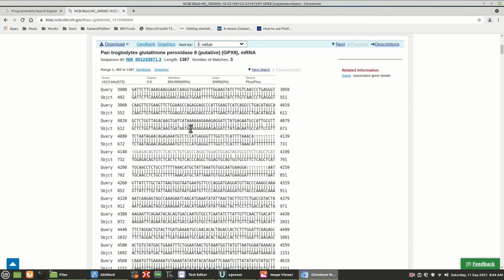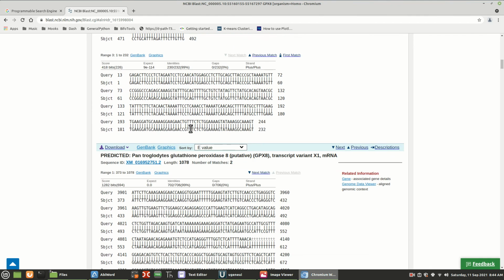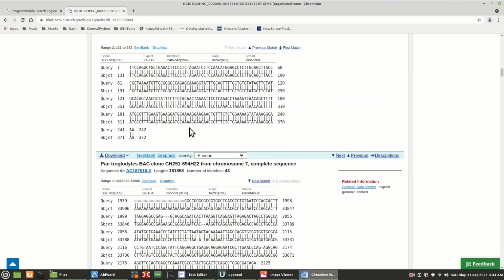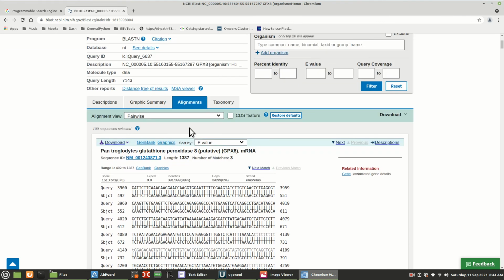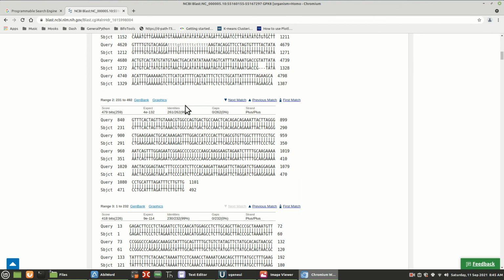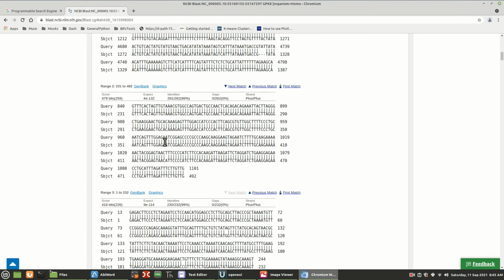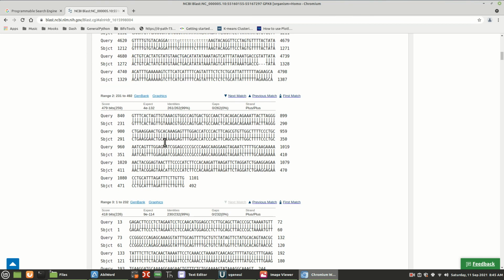the first exon would be this one, and then here's another smaller one and another one. Oh, these keep going. Make sure you stop on the right parts. So here, length 1,387. Here's another one. Here's another one, and then we go to the next one that you click on. So it's just these first three. These first three align because there were 3 exons. All right, so you get these 3.